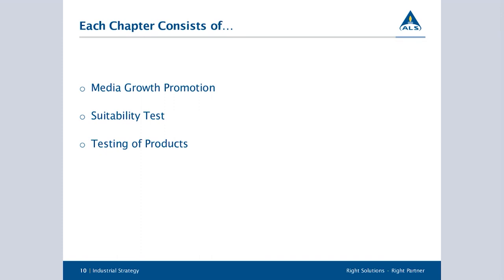Now, for selective agars such as MacConkey, it needs to prove that it supports the growth of the required organism while inhibiting others. And it is required per each batch of the media. Now, for suitability tests, the terminology has evolved through the years as well. Before, it was known as the prep, or the preparatory test, or the validation.